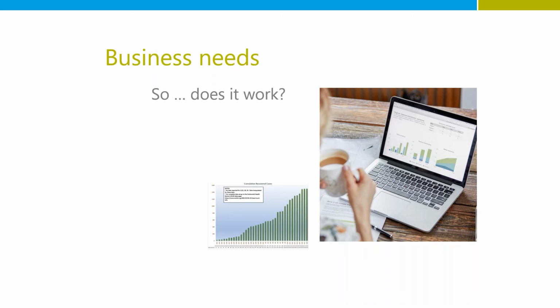Yeah, it works when you say you're setting really a foundation for continuous improvement. So you deploy a LIMS, you end up where you've got some training to do on your staff, and your processes are going to change, and that can affect negatively processes for a short while. But really the goal is to give you a long-term sustainable continuous improvement model. And that's really the foundation that you're looking to set, because there'll be some immediate things to resolve, but really that's the process to say, I want a way where I can continue to do this. How do I improve my accessibility? And really, how do I grow the system, adding new methods? How do I add new staff? How do I improve my training model? All those things are affected by deployment.